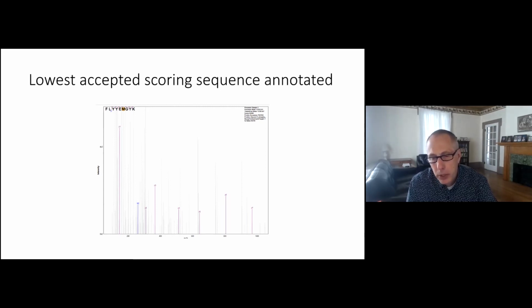In this example, if we looked at the MS1 for this peptide, where the mass was 1228.5, it's possible that we found other peaks at that mass to charge, and we attempted to match them all. So we provide multiple identifications for a single isolation event, if it's possible.